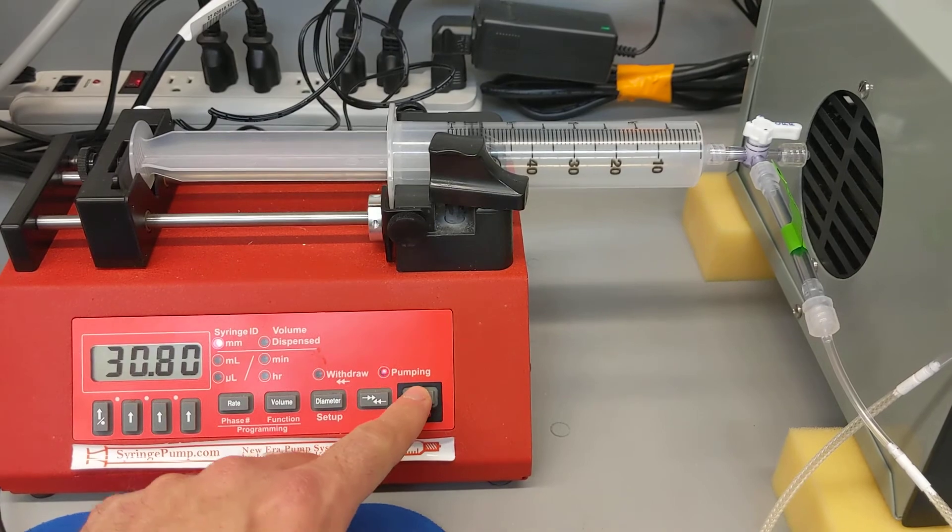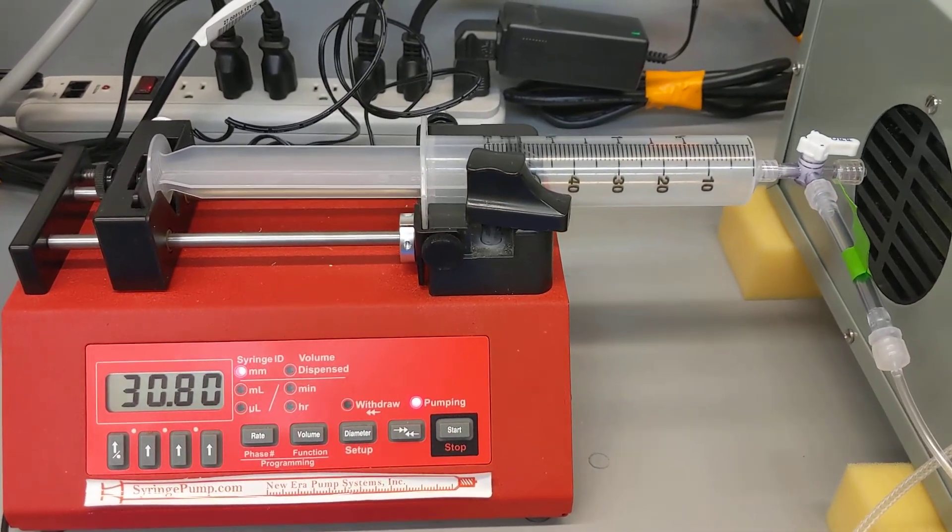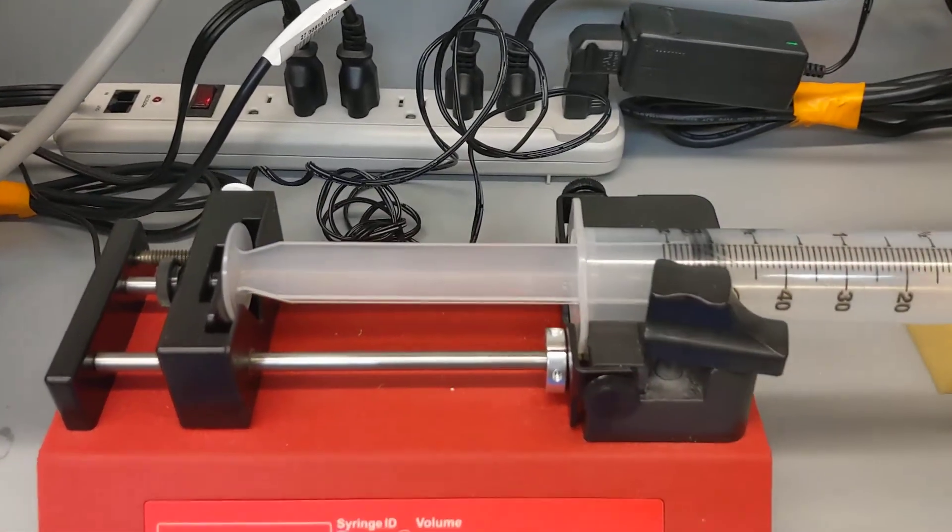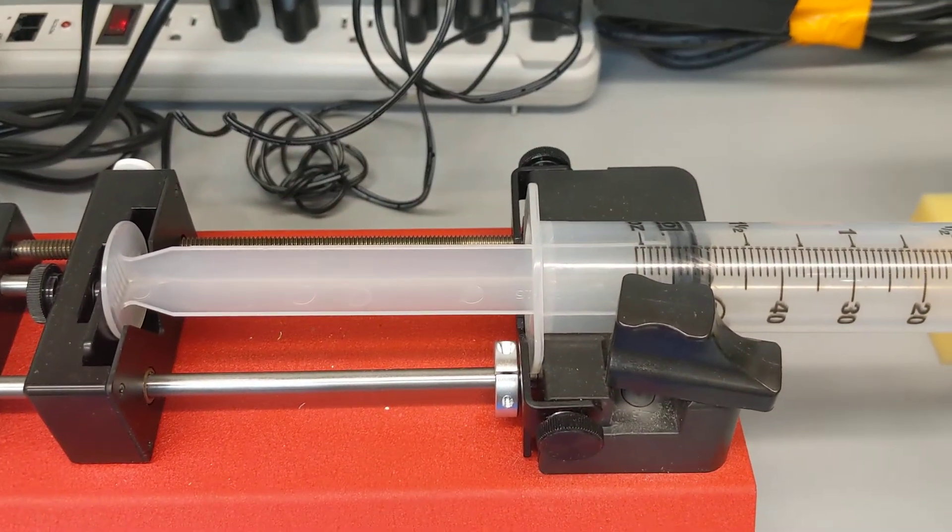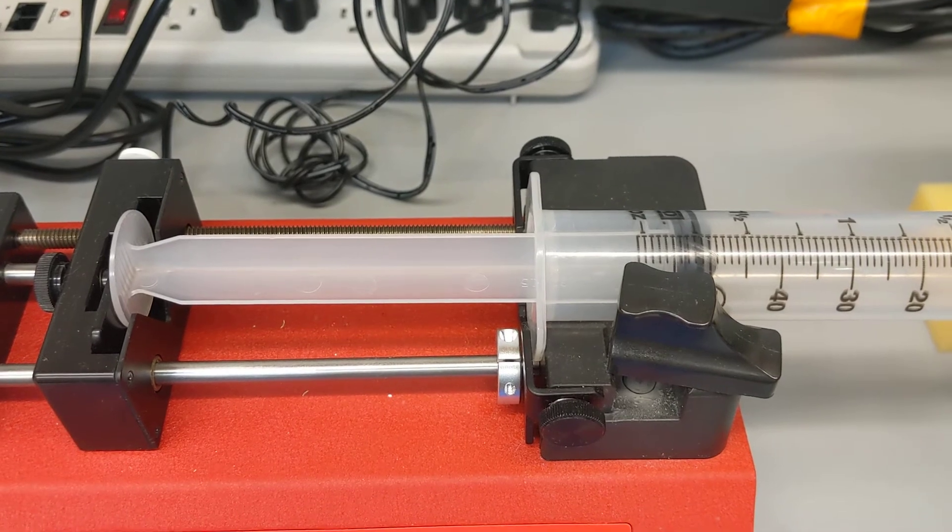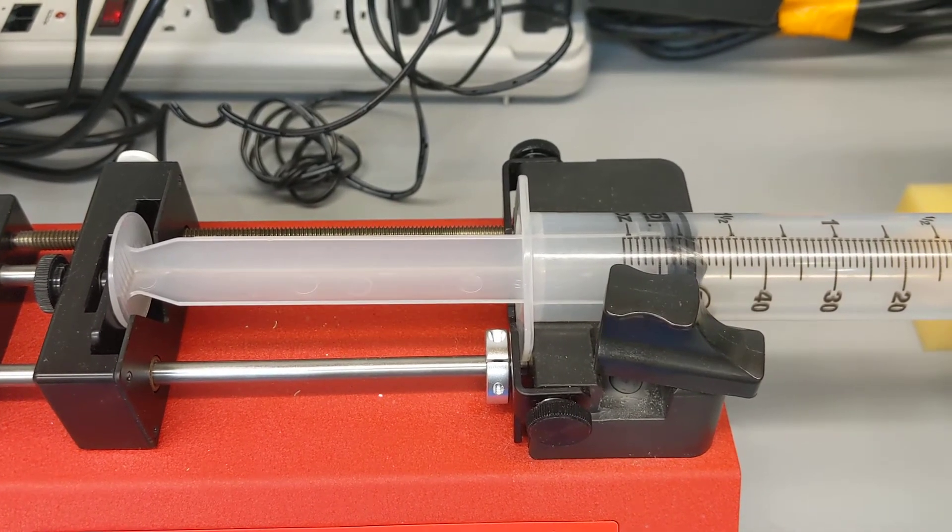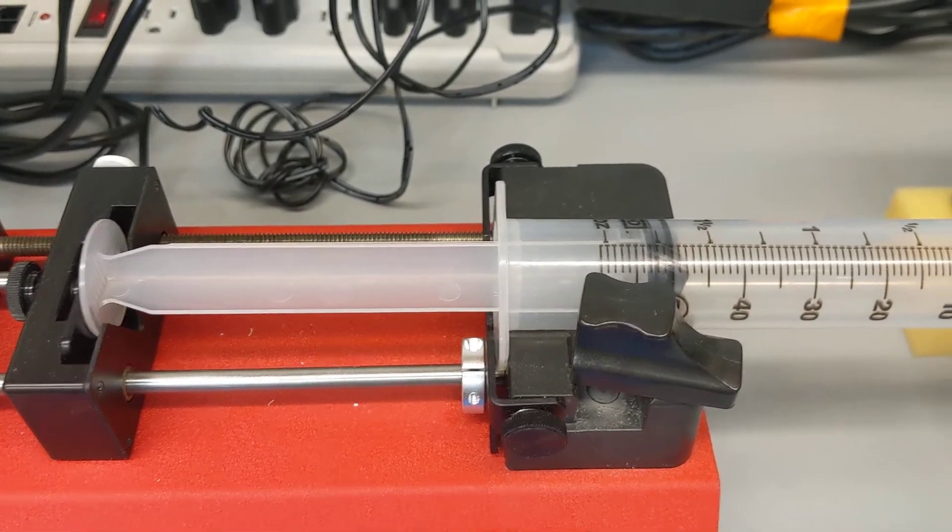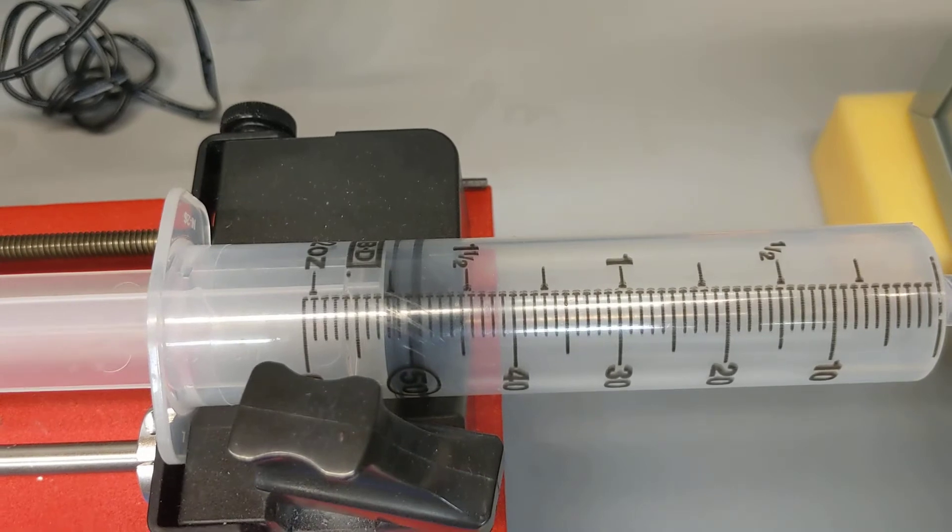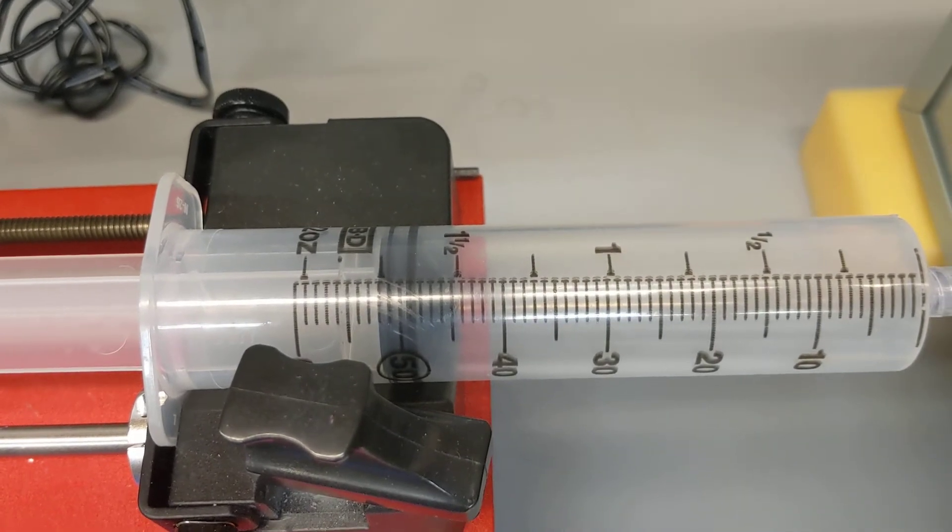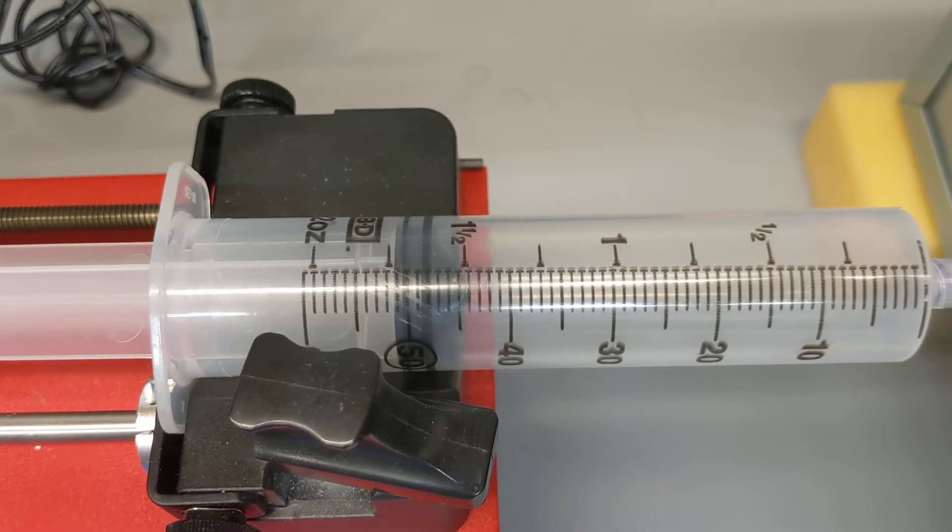So I'm going to start this. You can see right here, very slowly but surely, that pump is pushing the sample through. You can see that sample moving. It was previously at 50.